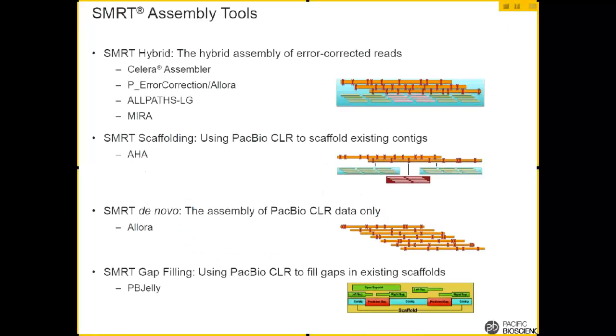I think this is more of the same. This is just a quick way to explain why people like long reads. Like I said, Illumina dominates the market. PacBio has been trying to find its way into a niche area. One of its niche areas is helping in finishing off the sequencing of genomes. So you have a genome, you have several scaffolds. They haven't quite assembled all the scaffolds into a full chromosome. And usually, this is because there are these repeat regions.